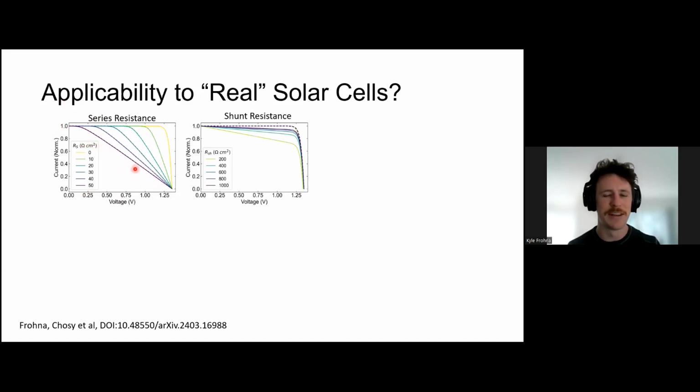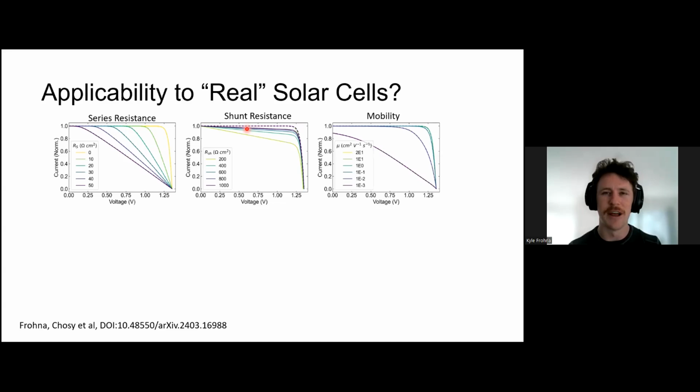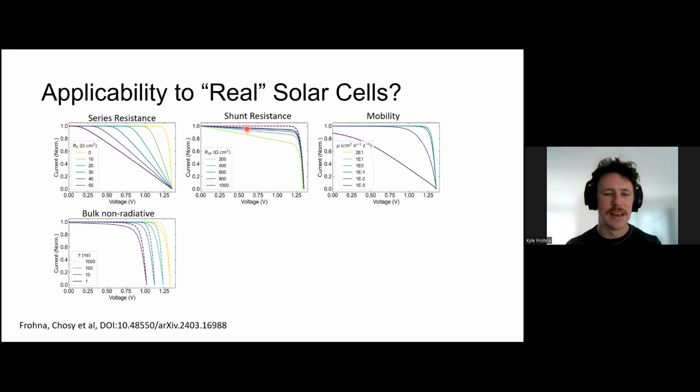So they're totally overlaid. With shunt resistance, we actually miss this because some current flows parallel to the diode. And so if you're using this technique and your devices are heavily shunted, you might think that they're better than they actually are. If you have lots of mobility problems, you can still detect that very nicely. If you have extremely short non-radiative lifetimes, you will overestimate your fill factor with the PL.